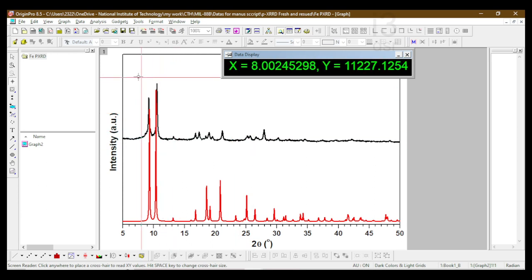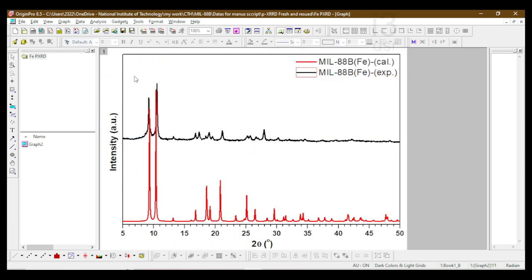These are the important peaks which need to match superbly, because suppose I get data where the first peak around 8 is higher and after 10 is smaller, though they may be in the same position, the morphology or the topology varies. You should know that. So the peak size or intensity does matter here.